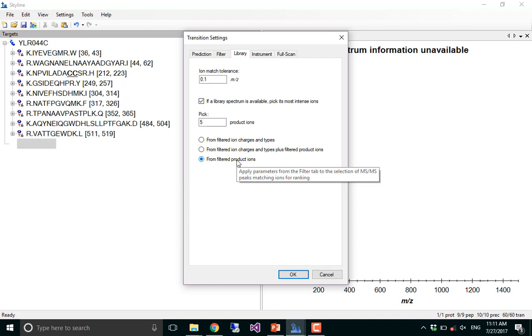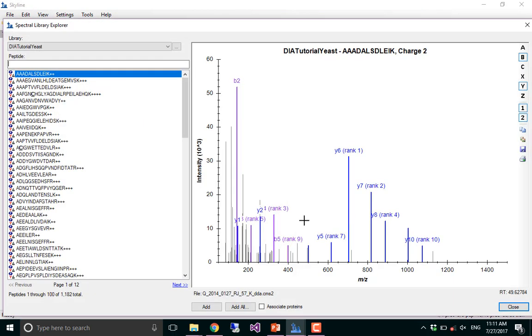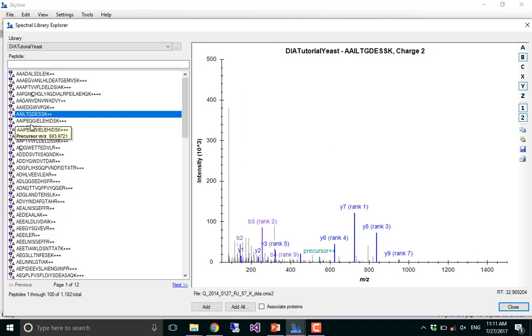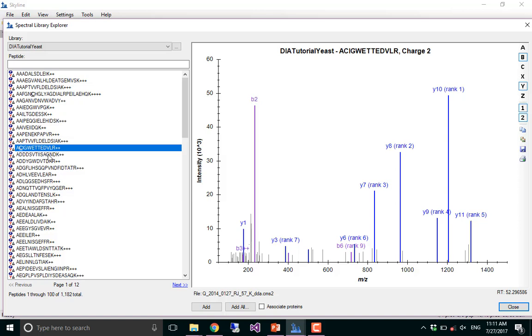Or are they what? Cleaned? Oh, you mean versus just opening it in the spectral library viewer? It should be the raw spectrum, if that corresponds to a spectrum that was provided to us. There are tools, like MaxQuant, that do things to the spectrum, in which case it may not end up being exactly the same.